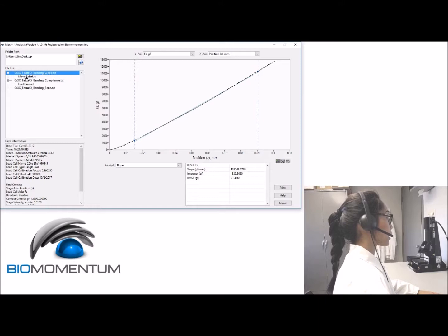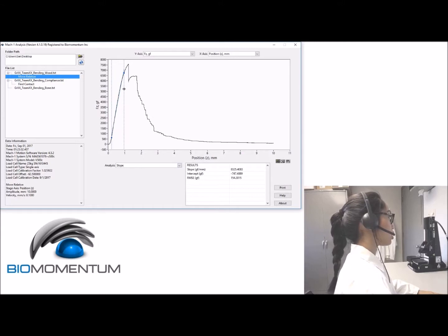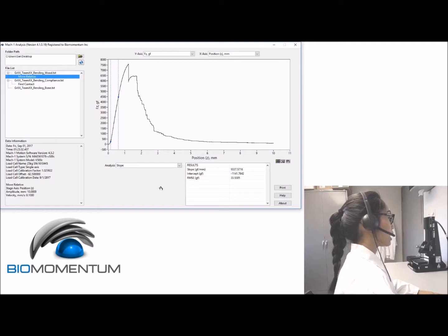Click on the file and select 'Move Relative.' Click on the slope analysis and drag the cursors in a region of interest, which corresponds to the linear region of the curve for the analysis, and report the slope as the measured slope.